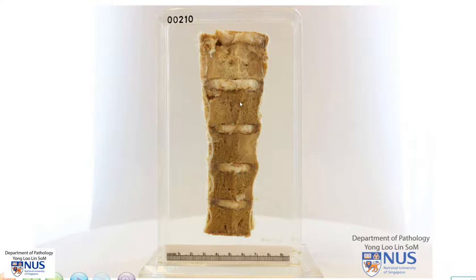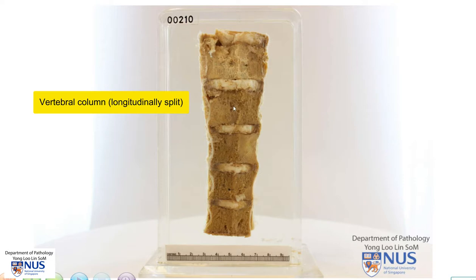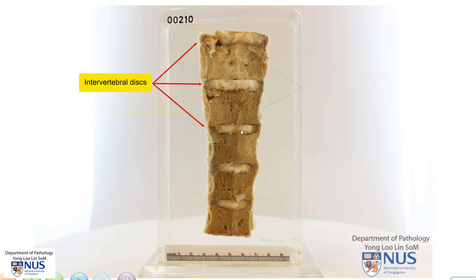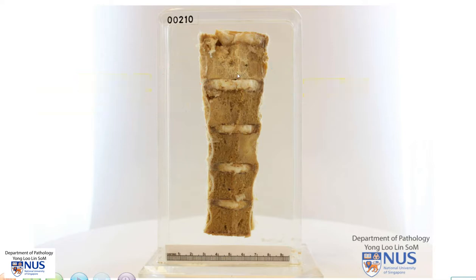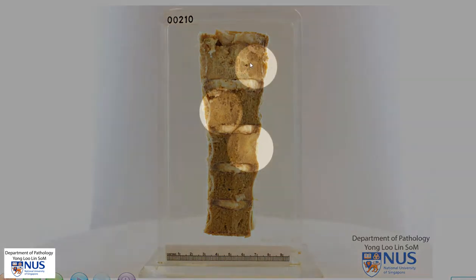Hello, we're looking at a specimen of a segment of the vertebral column that has been longitudinally split and we can see the cut surfaces of the alternating intervertebral discs and the vertebral bodies. I want to draw your attention to three areas which appear abnormal on the cut surface of the vertebral bodies.